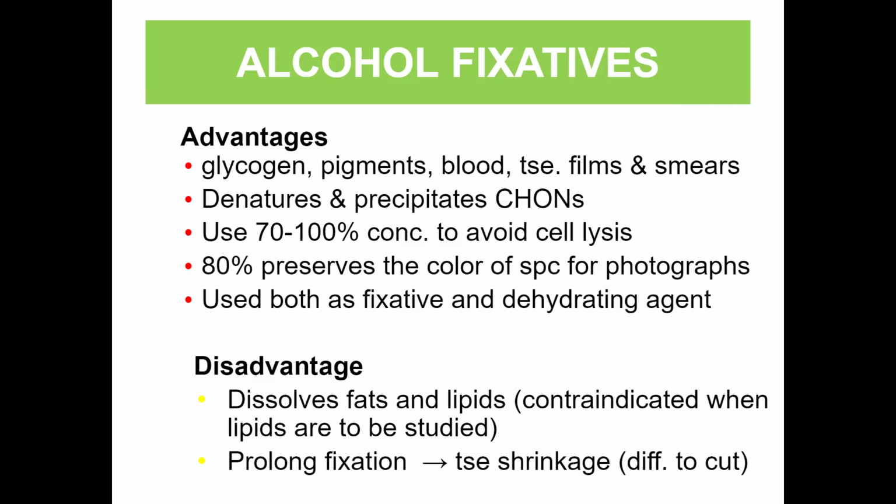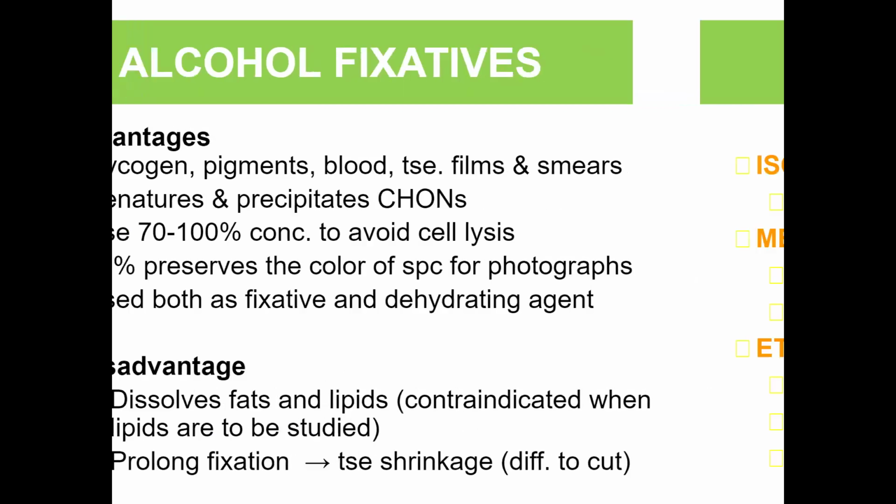Disadvantage is that it dissolves your fats and lipids. Hence, it is contraindicated when lipids are being studied. Prolonged fixation would also lead to tissue shrinkage, which is difficult to cut. It shrinks of course because it is a dehydrant. It removes the water from the cell, hence it would shrink.